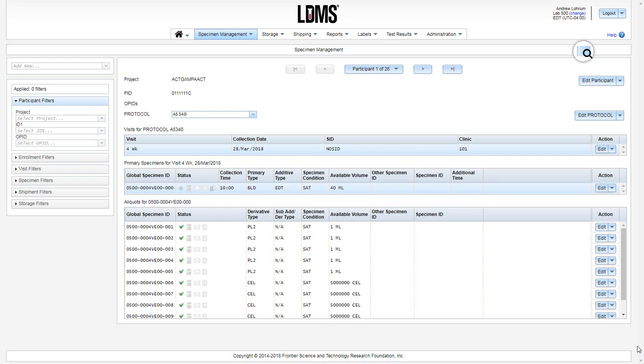This video tutorial will cover the generation of labels in WebLDMS. Outside the dedicated labels module, you can print labels in specimen management, storage, and shipping.